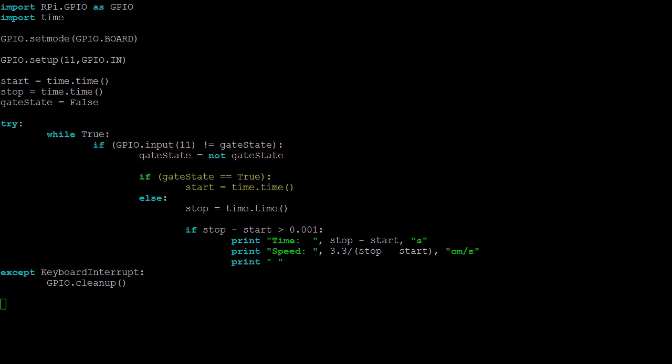Next, if the new state is true, something has just entered the gate so a start time needs to be recorded. On the other hand, if the new state is false, something has just left the gate and the stop time needs to be recorded. At this point, we can output the time difference, and if we know the length of the object that passed through the gate, we can also calculate its speed.